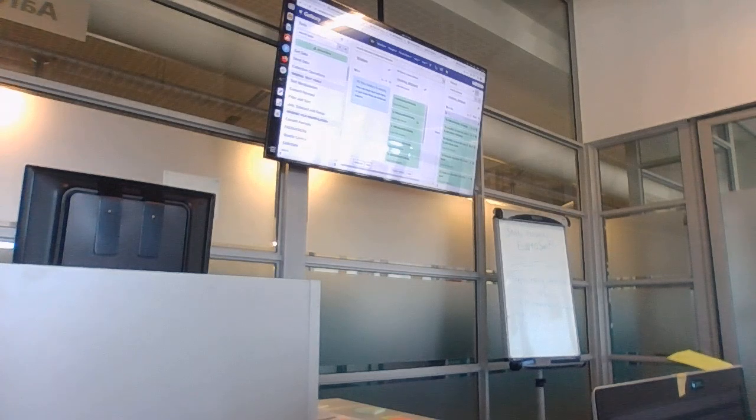So yes, we are only uploading the forward or the reverse, whichever you chose. And the question is, shouldn't we view it as a pair? It doesn't really matter because remember, if the sample was contaminated and you sequence it that way and that way, they will both show that it's contamination. And the less work we can give ourselves with crafting, the better.